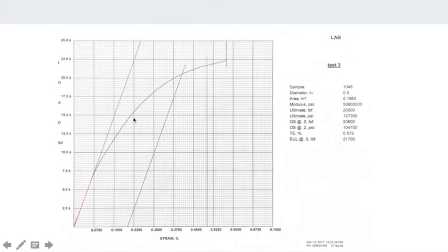This line over here represents the elastic deformation. This is the way the material behaved, this curve. This point right here represents the point where the yield strength is at its maximum. And if you release the material from the machine, it's supposed to return to this shape. After this point, it's the plastic deformation, and it gets until this point, which is the ultimate strength, where it breaks.